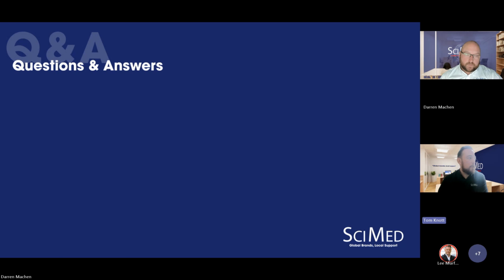And another one from earlier on the other day, related to a different project. I think it's relevant here: are there any ways that you can integrate, particularly NIR, but also XRF, into automation? So from my side, yes, obviously the PAT is very much akin to automation, i.e. you are speaking to third party sensors or systems.